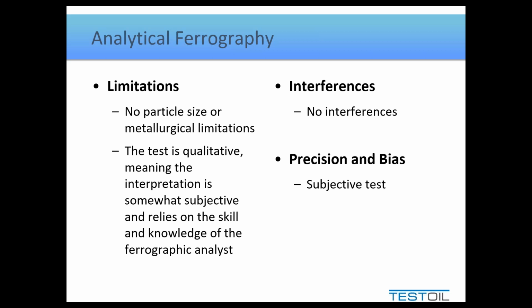If they're large enough, they can easily tell the shape of the particle. Are they long and skinny, flat platelets? Are they curled up? And by color, they can tell, is it silver metallic versus does it look like brass? But also they can tell, has it annealed? Has it changed color? Things like this help give us some guidelines into the basic interpretation I'll show you next that categorize what particles are being seen by the wear mechanism that created them.